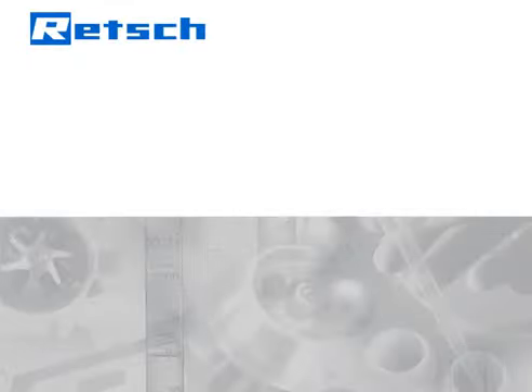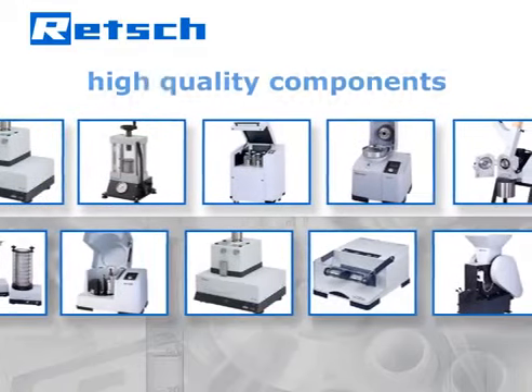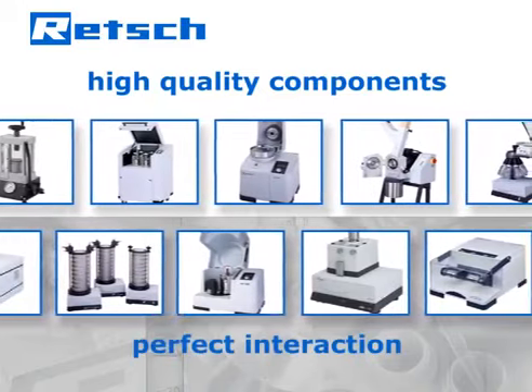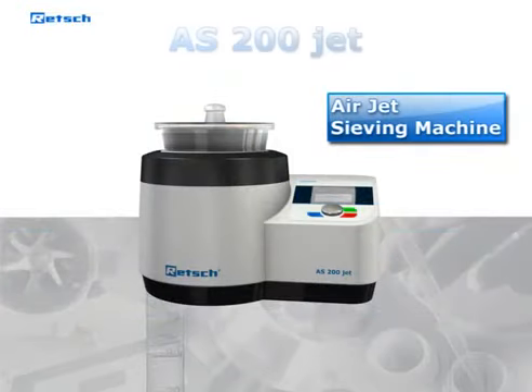Rech's product philosophy is based on a quote by Aristotle: the whole is greater than the sum of its parts. Therefore our R&D department does not simply choose high-quality components but also pays full attention to their perfect interaction. It is this approach which determines Rech's products to be superior and makes our airjet sieving machine AS200Jet the optimum solution for perfect quality control.